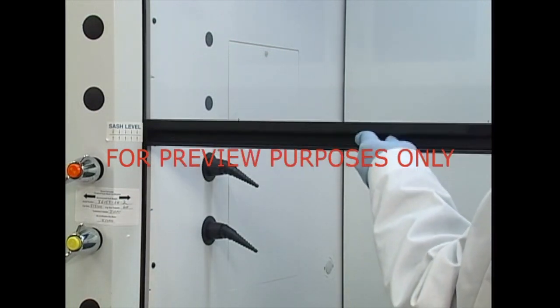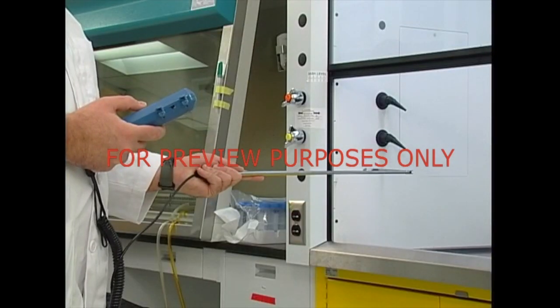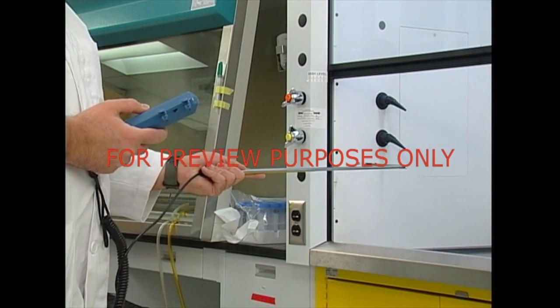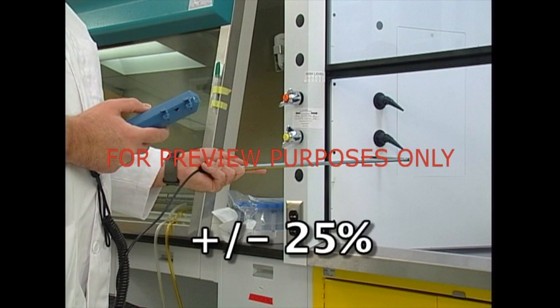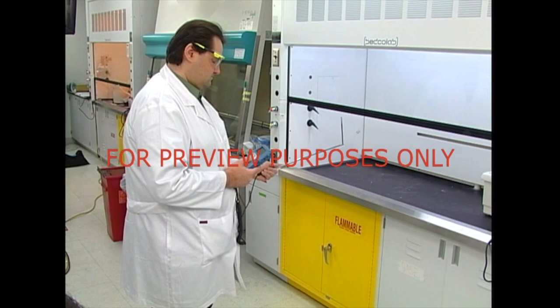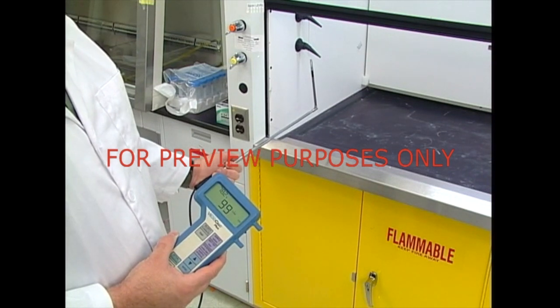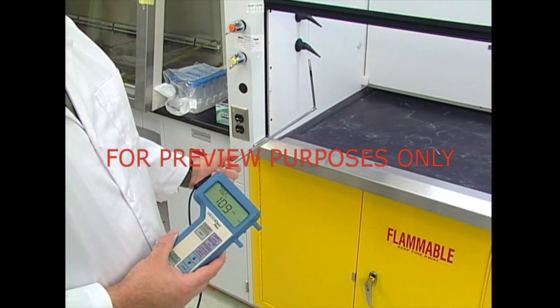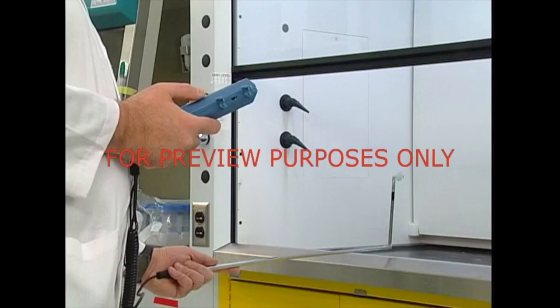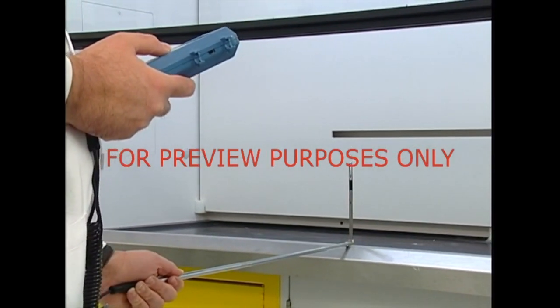When measuring face velocity, the sash should be adjusted as if you were about to begin work. Your supervisor will divide the hood face into a grid pattern and measure the velocity of the air in each section. Values at specific points may vary by plus or minus 25% without compromising the safety of the hood's operation. But no measurement should be below 60 linear feet per minute. If your test shows a lower speed, the airflow should be adjusted before the hood is used again. Your supervisor will also compare the face velocity with the speed of the cross-draft to make sure the cross-draft is never greater than 20% of the face velocity. If this is a problem, the interior hood baffle will be adjusted, or if necessary, the ventilation of the laboratory itself may need to be altered.